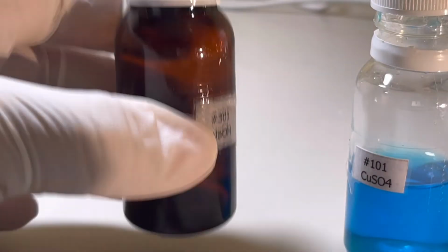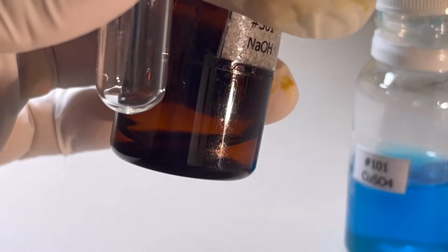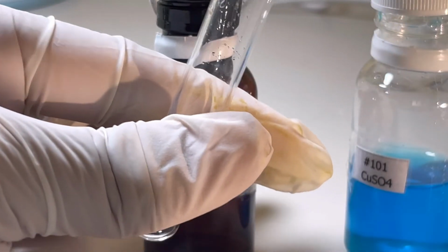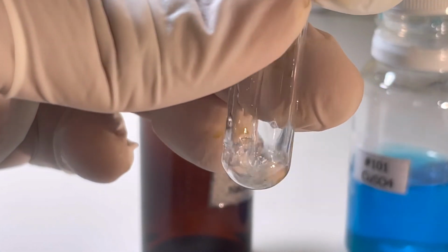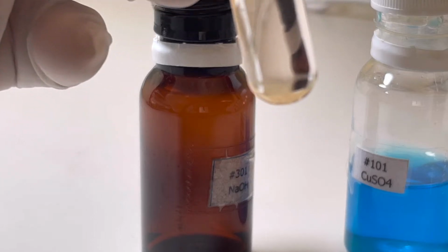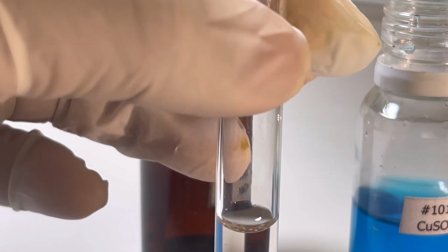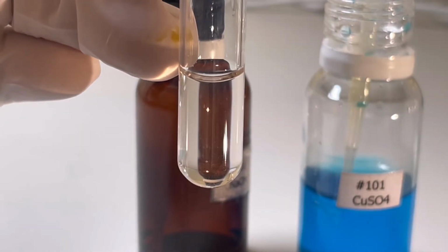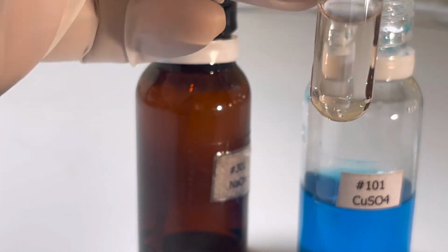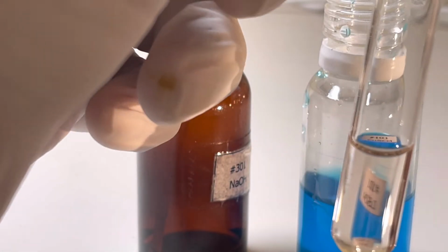I pump it to the tube and then pump it into here. This is colorless sodium hydroxide. And this is copper sulfate, blue color. Okay, you see this one?